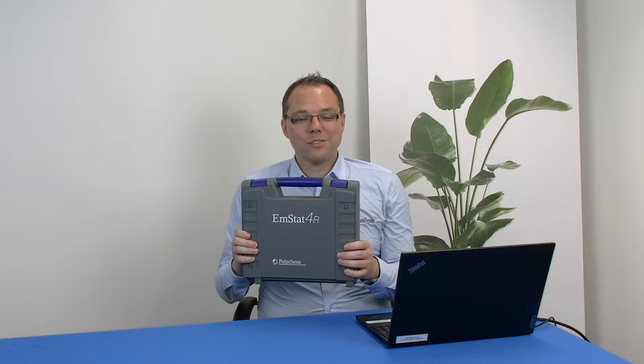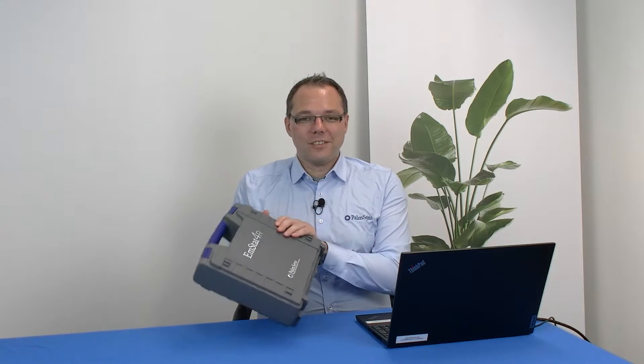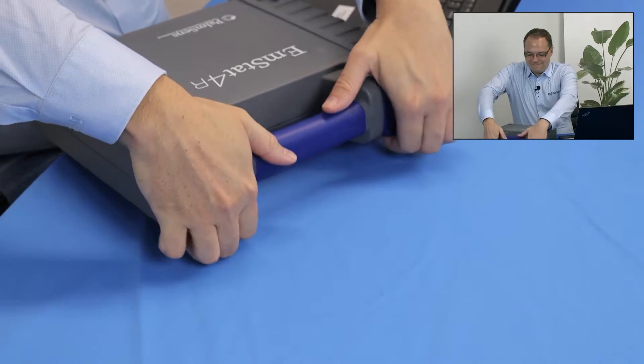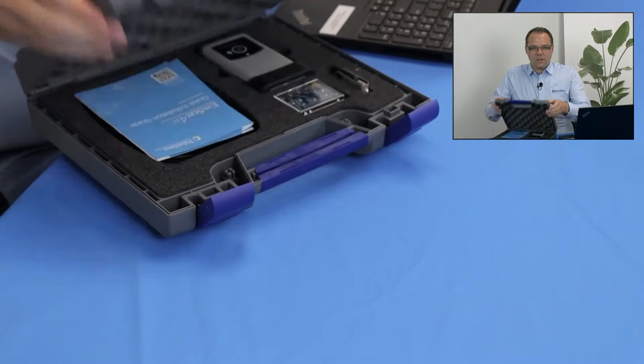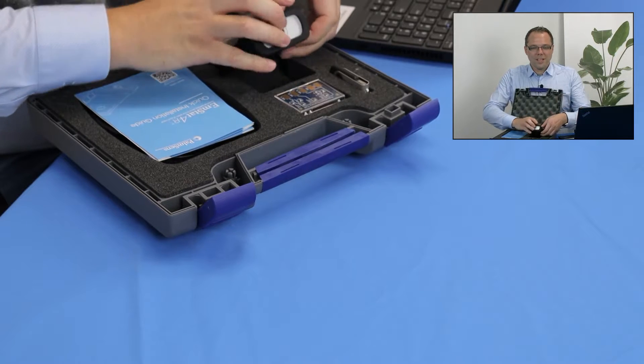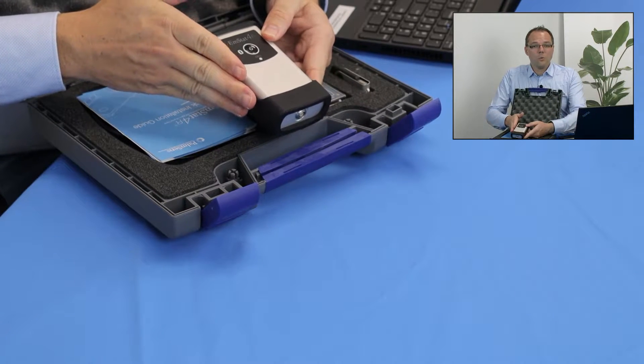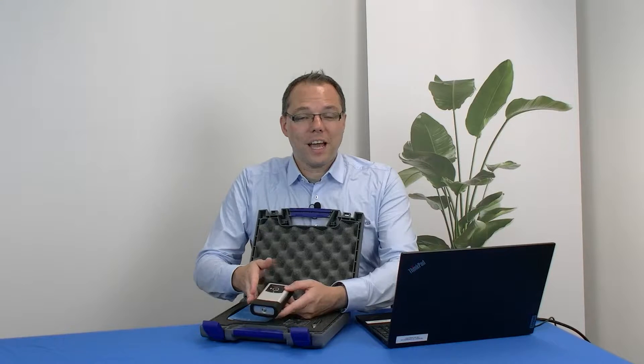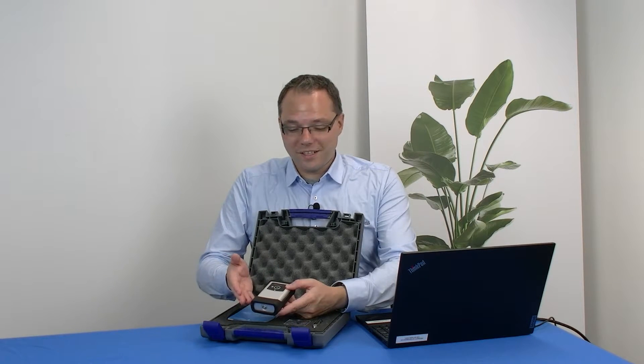As most of our instruments, this one comes in a case. So let's have a look what's inside. You will find in there the Emstat 4R, which is an Emstat 4 with battery and Bluetooth for wireless operation.